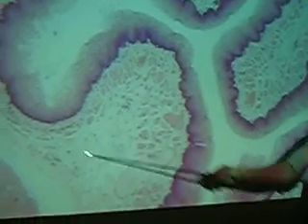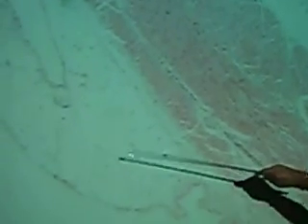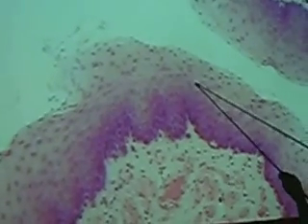All 3 of those are part of the large layer called the mucosa. This is the second layer where it turns a really light color. That's the submucosa. And if I keep going in that direction, this is called the muscularis. Good. And this is either serosa or adventitia, either one. And if we come back to the mucosa and I get more specific, I could put it on high power and say, name the epithelium. Stratified squamous non-keratinized. And if I say name the CT layer under it, lamina propria. Yeah. And then that's it for that.